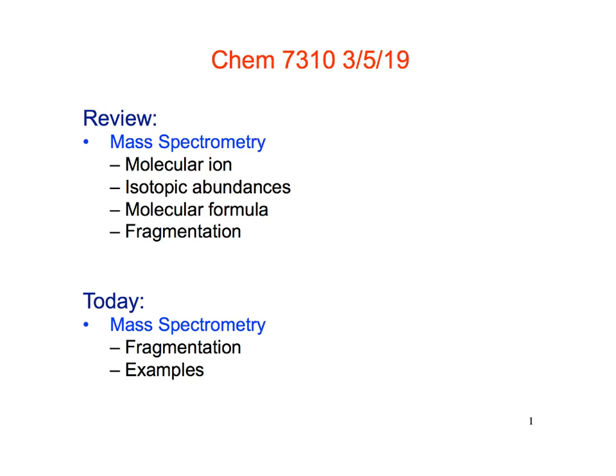And what you'll see is that it's not always as simple as we hope it will be. Some of these I tried to pick as reasonably simple examples that could be explained just by the fragmentation mechanisms that we are talking about, but it seems like there's always something else more complicated that takes place.